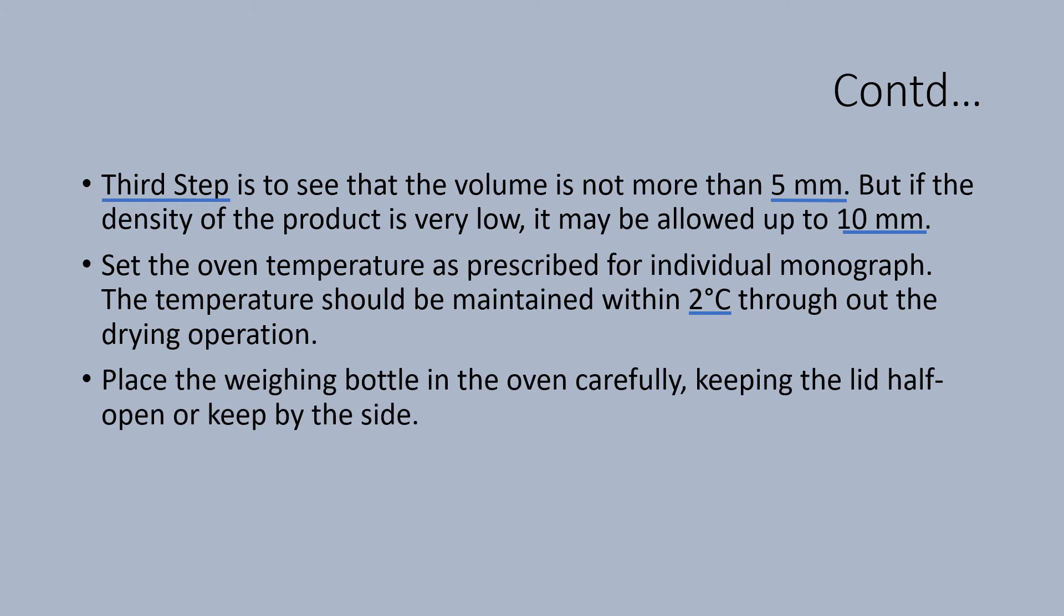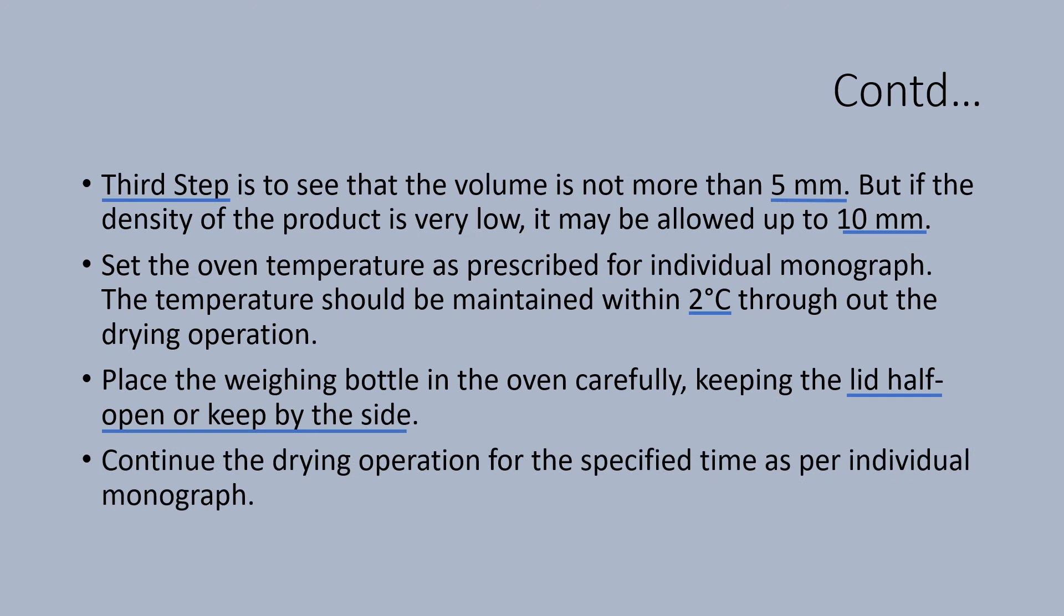Place the weighing bottle in the oven carefully, keeping the lid half open or keep by the side. Continue the drying operation for the specified time as per the individual monograph.